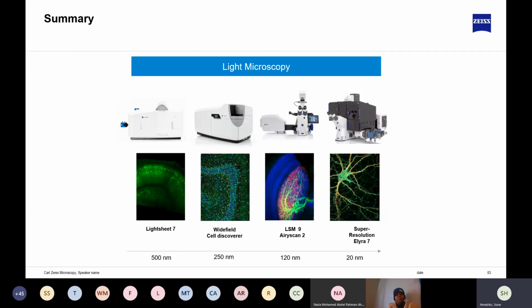The key to success for you to consider is your imaging parameters and to decide what type of questions you want to answer, and based on that, decide which type of system will fulfill your needs, considering that there is always some sort of payoff between the different techniques.